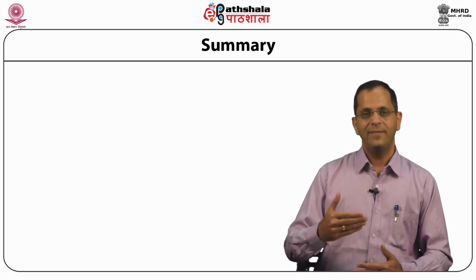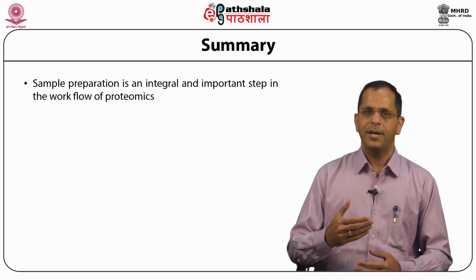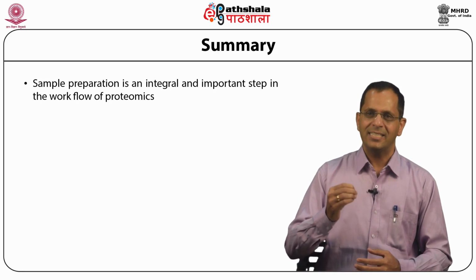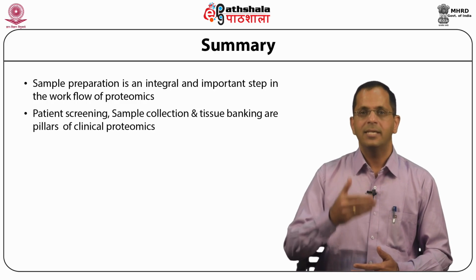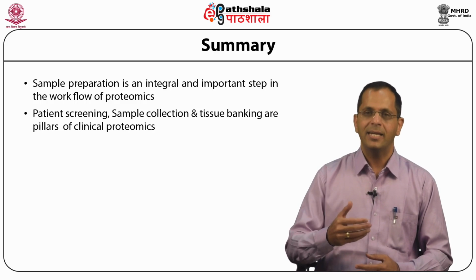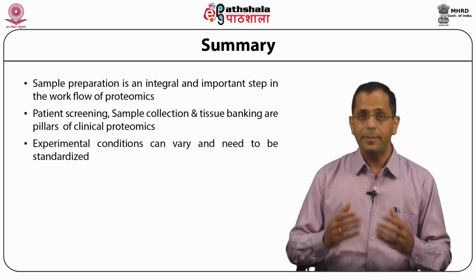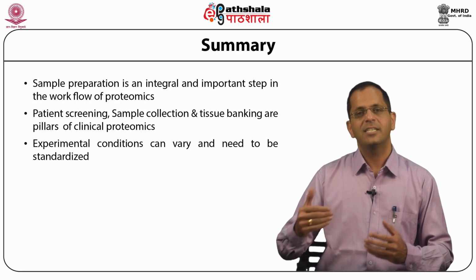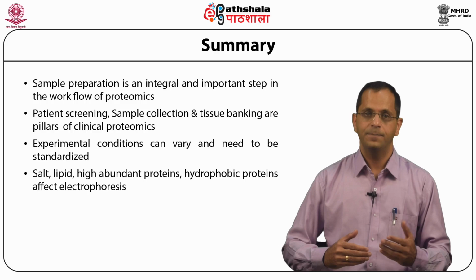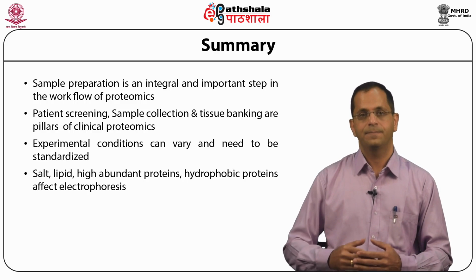Finally, what have we understood in this particular module? Let us summarize. Sample preparation is a very important and integral step in the workflow of proteomics. Patient screening, sample collection, and tissue banking are important pillars of clinical proteomics. Experimental conditions can vary and need to be standardized based upon the research question. Salt, lipid, high abundant proteins, and hydrophobic proteins affect the gel electrophoresis.